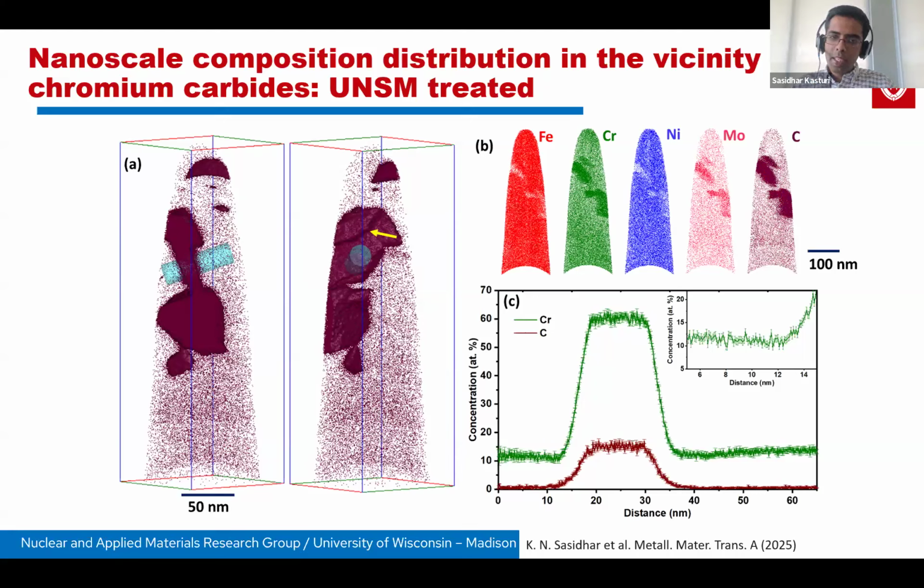I mean, atom probe data is extremely versatile and you can have a number of different visualization methods. I think, yes, you're right. You use an ROI of your convenience, and then you plot a chromium ion density variation, you can see this difference. Yes, absolutely. And I think the proxygram is also a useful tool here because each calculation we do in atom probe really hits different spots of that analysis space. Yep. That's a great question.